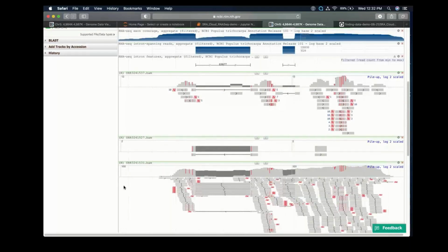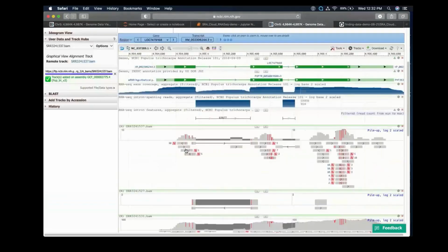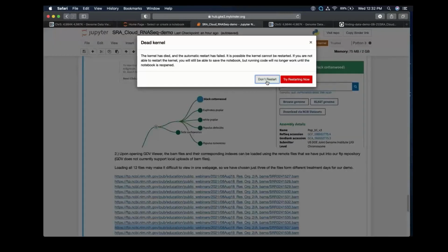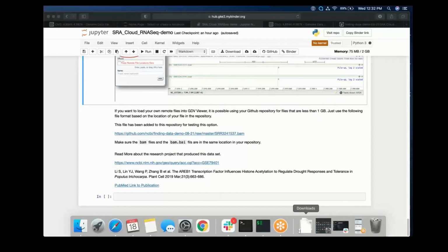So you could probably do some more downstream analysis, looking at counts and averaging counts across the different treatments, so they get a really true view of what's going on. But if you're just interested to know whether this gene's being expressed in your genome in a particular RNA-Seq data set, this is a notebook that will help you accomplish that. Okay, and that's kind of all I had to say about that. And yeah. Peter, how do I hand it back to you?